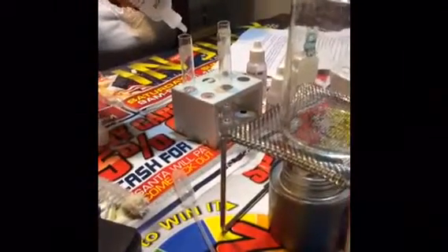Good afternoon. My name is Chinyere Ogugu, working on Chemistry 115, Summer 2, Section 6, Week 5 Lab, the synthesis of fragrant esters. Beginning with dropping 4 drops of acetic acid into my test tubes numbered 1, 2, 3, 4.